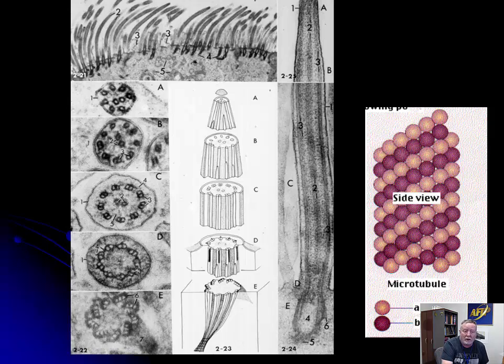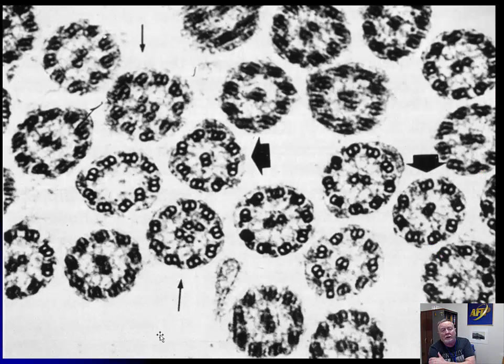There are problems which are diagnosable via EM. This is a very classic picture that was actually on the ACVP board exam. So if you weren't familiar with this particular condition known as ciliary dysgenesis, you might be sort of messed up.